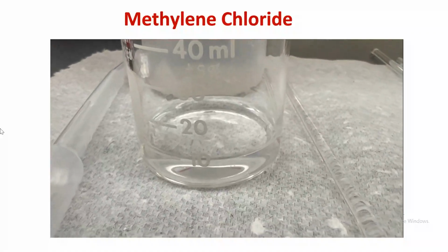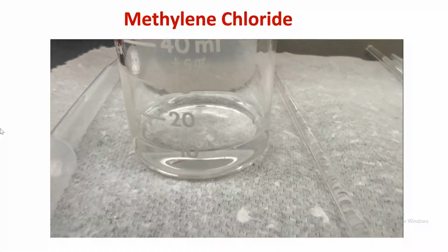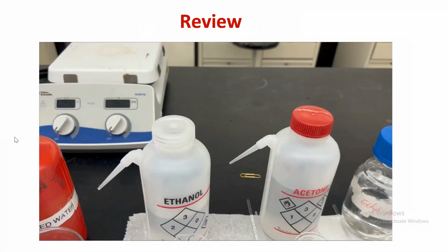So in your observation, in your final summary, make sure to talk about the bubbles and how you were able to know for certain that you saw more than one layer. It's because of the bubbles.